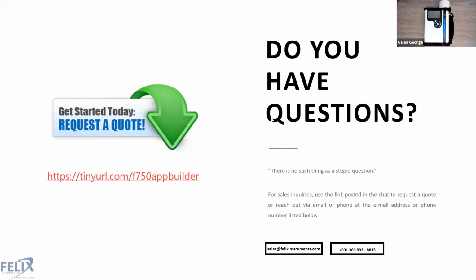The next question is, is the bin size feature new, or was it present in the old Model Builder software? It is a new feature in the sense that it is now a very easily accessible, easily changeable feature within the device itself. So that actually is pretty brand new. If you were a more advanced user of Model Builder, you probably could find a way to do that on the instrument as well. But it is a relatively new feature as far as ease of use. So thank you, Roy, for that question.